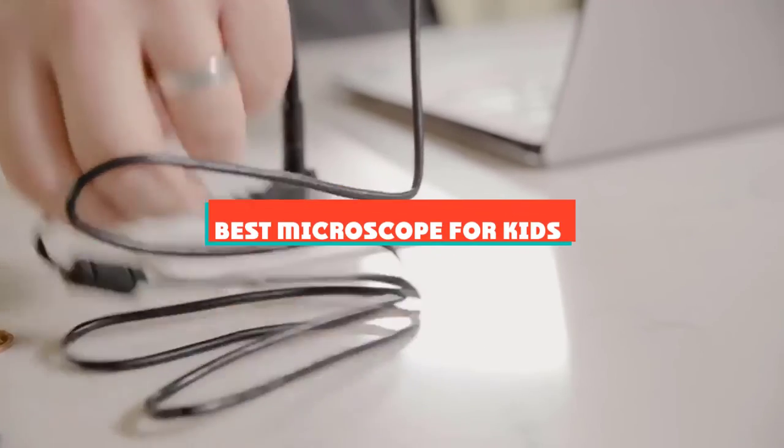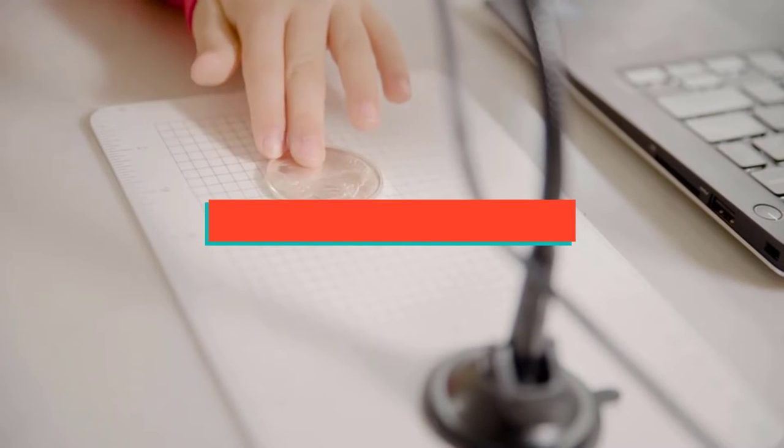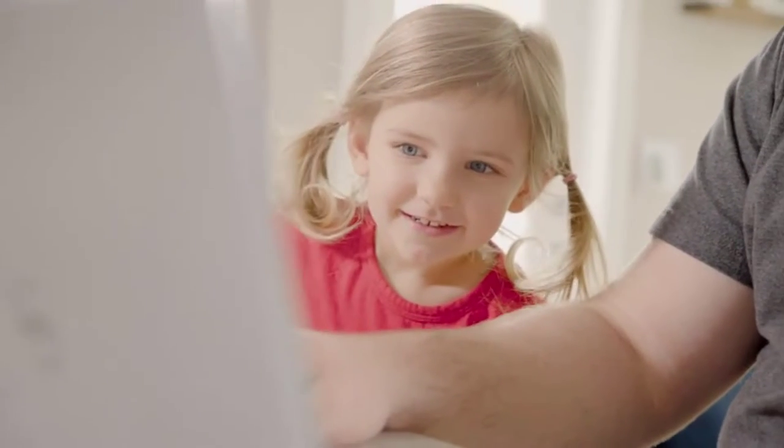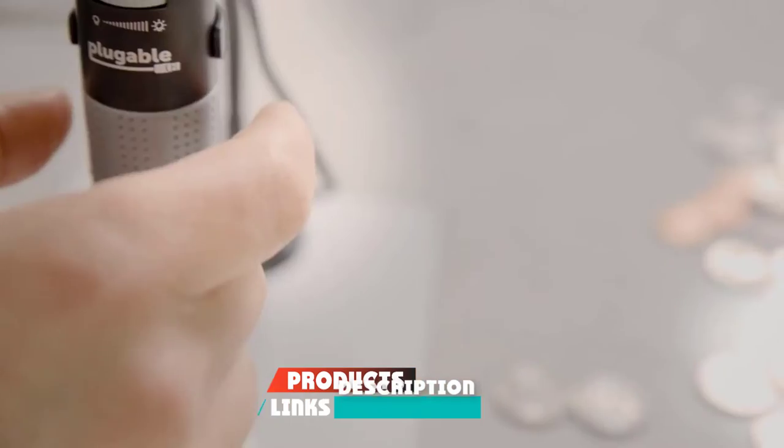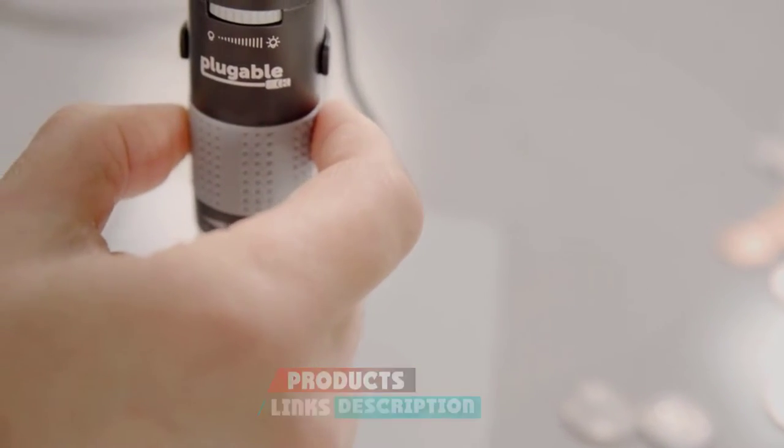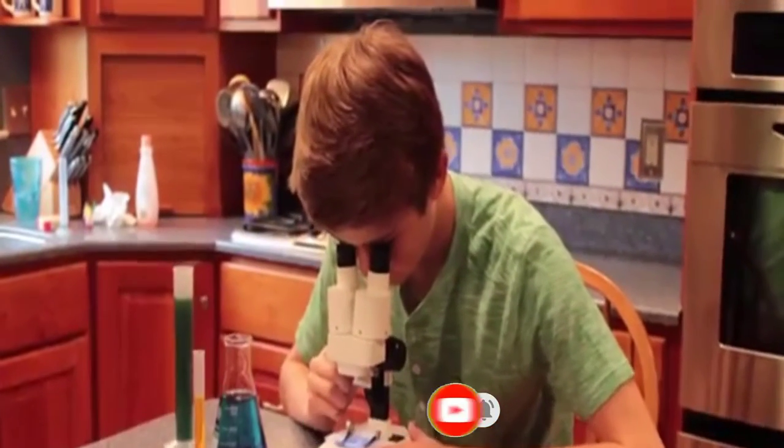If you're looking for the best microscope for kids, here's a list you must see. We made this list based on our personal preference and sorted it based on their features, prices, quality, durability, and reputation of the manufacturers and customer feedback. Also, we've included options for every type of customer. So let's get started.